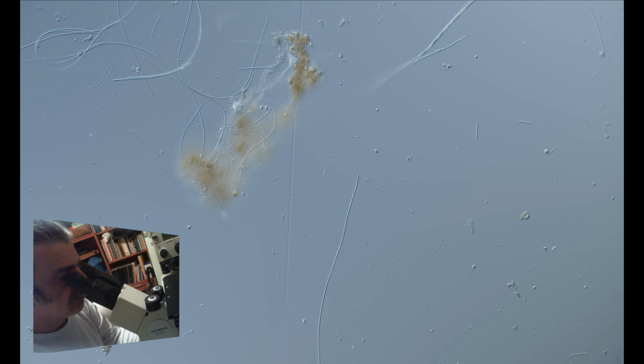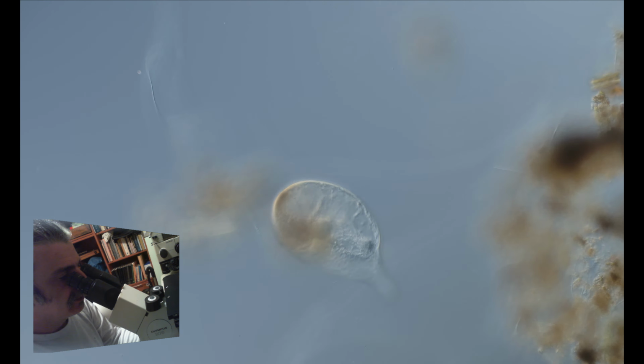I moved two down. Sorry for the fast movement, I'm in the middle of scanning. Actually, I'm doing it much slower than I'm used to.